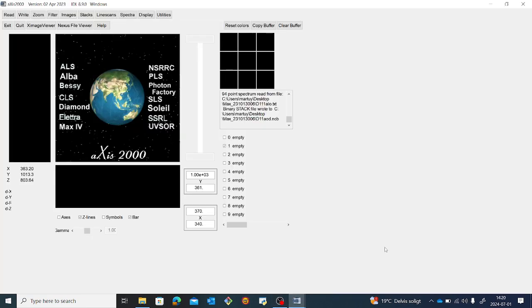Welcome to this video. In the previous video, we introduced aXis2000 for STXM data analysis. We also looked at the installation process and how to remove bad lines and bad images if they are present in the stack. Finally, we also looked at how to align images within the stack.